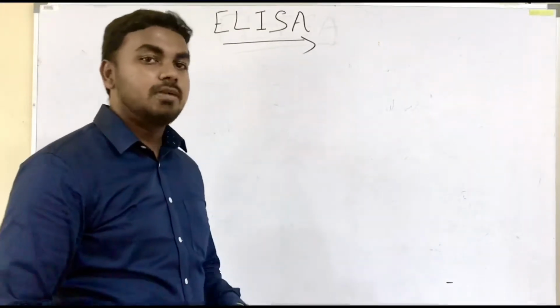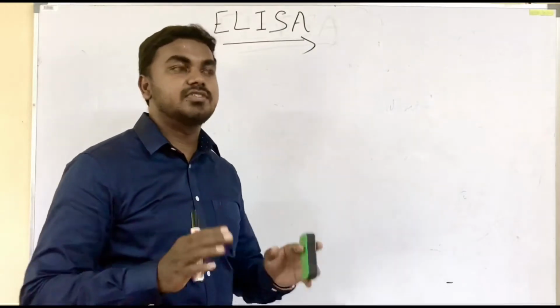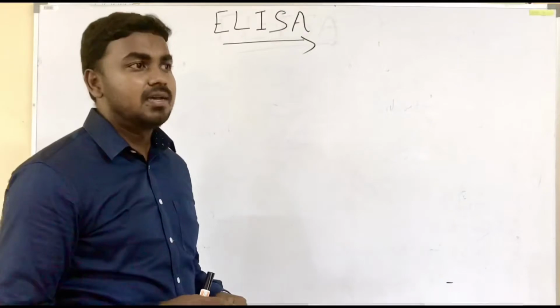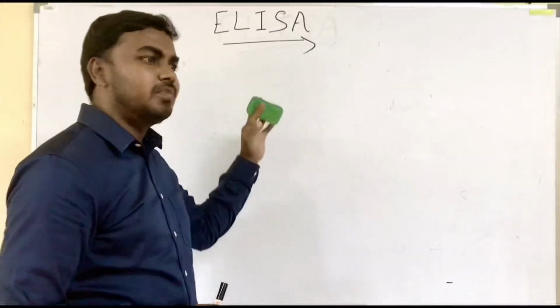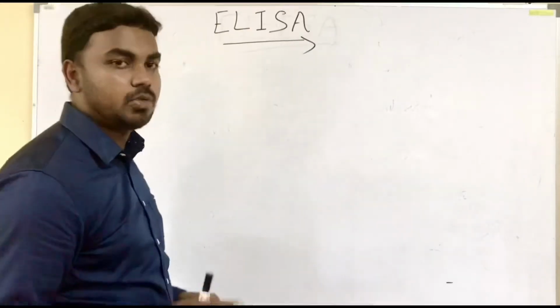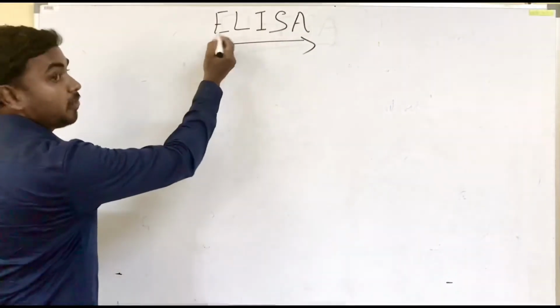Today we are going to learn about ELISA. In the first part of the video, we have to only concentrate on the principle. If no one knows what ELISA is, here I have written the abbreviated form. I'm going to just expand this, nothing else in this video. So just concentrate, you will get an idea. Okay, we know this is the abbreviated form, and we are going to expand it.